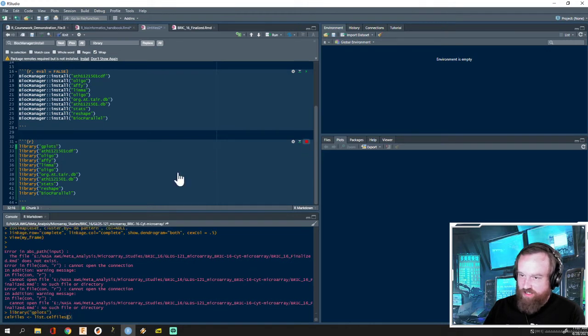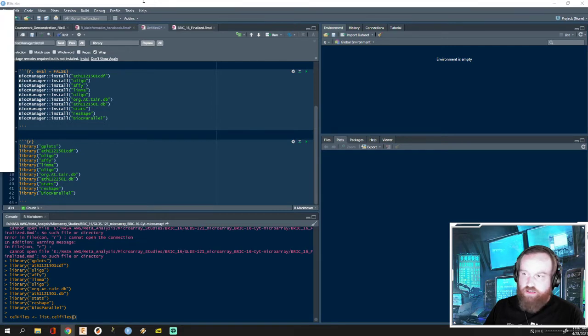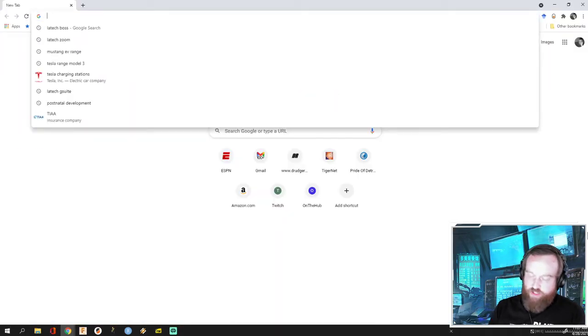Let's hit run, and we're gonna load all of our libraries here, and we are set to do analysis. Now, what are we gonna do analysis on? So let's go to the Googles. We're gonna type in Genelab.